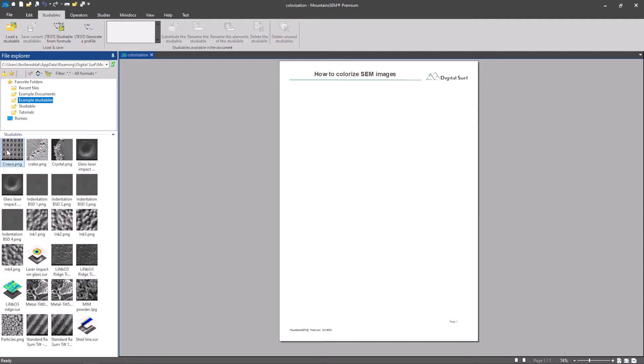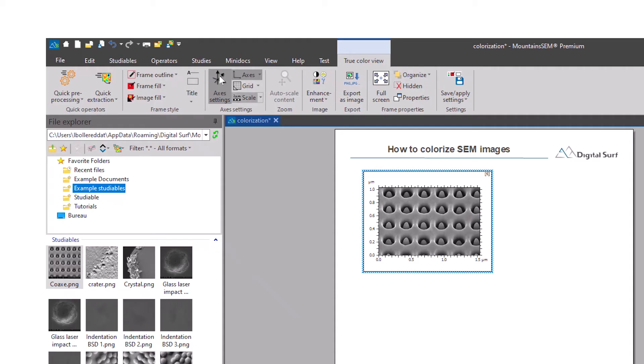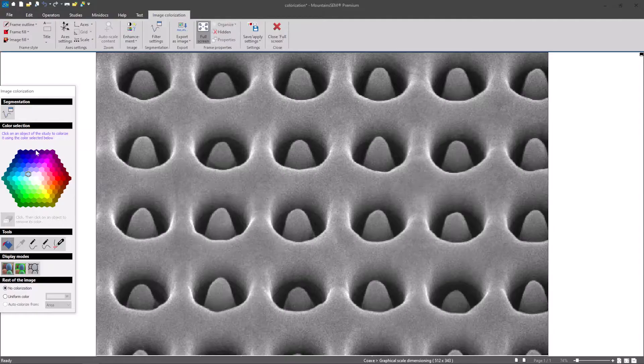Start by loading the SEM image you'd like to colorize. In the Studies tab, select Colorize Image.